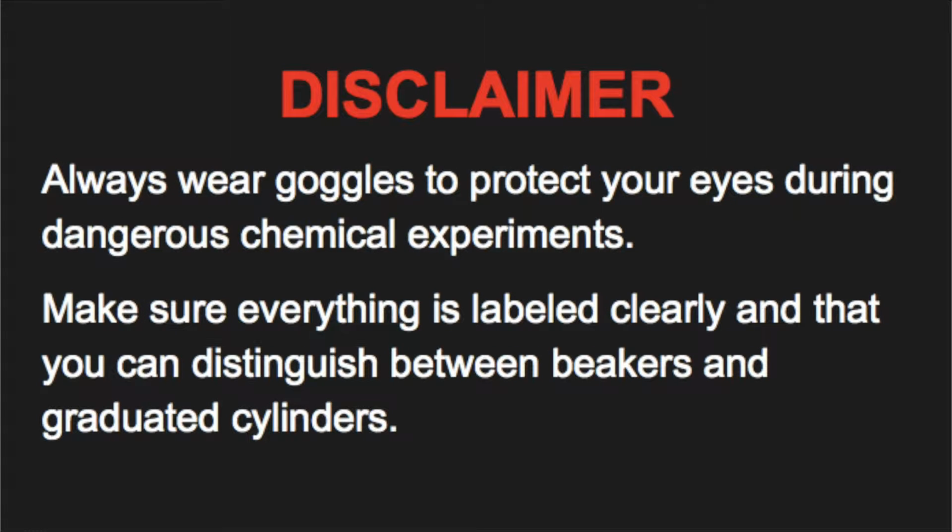Disclaimer: always wear goggles to protect your eyes during dangerous chemical experiments. Make sure everything is labeled clearly and that you can distinguish between beakers and graduated cylinders. Let's begin.